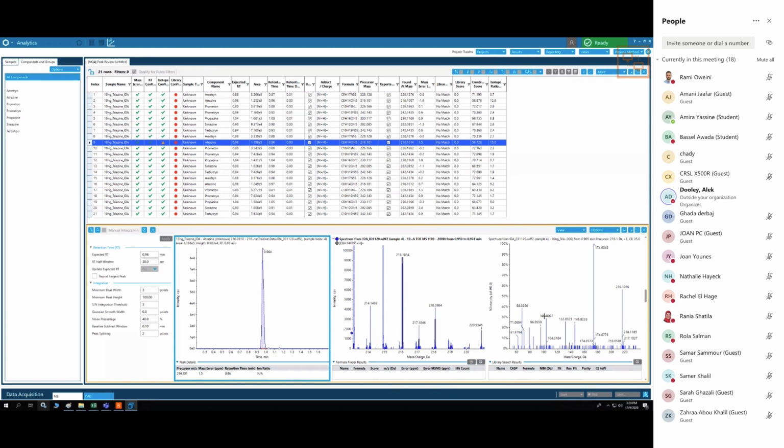Okay, so any questions on how we got to this point? Now I have the data in a very nice way to look at it, and I'm now prepared to go through the data rapidly and to see what I can actually find in the data. Any questions?